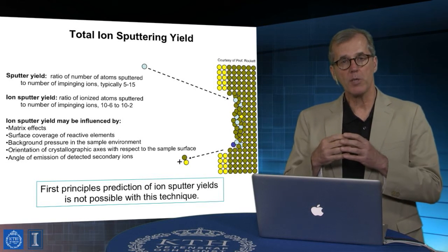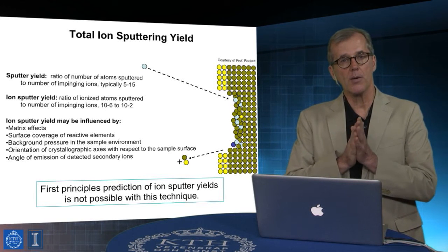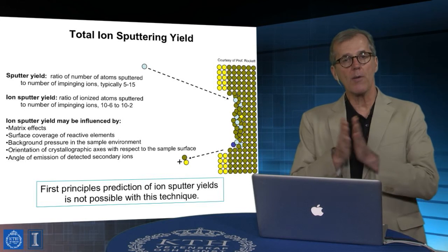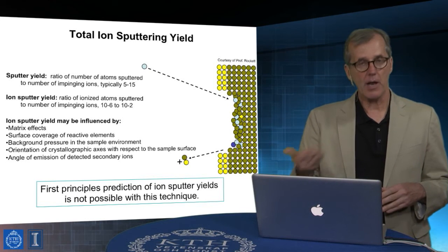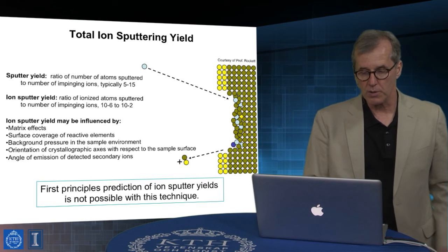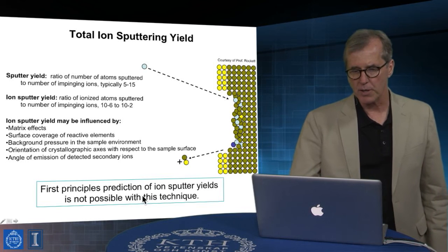Depending upon where those materials accumulate, they might dissolve into the polymer and be stably dispersed in it, or they might actually segregate to ambient interfaces. We would detect them in high concentration in SIMS because they're not homogeneously localized. And of course, many other things come into play as well.